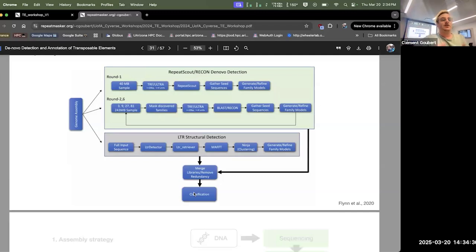So in this software, the classification is based on a high-quality database of protein and nucleotide sequences. It's going to help you identify known families, or at least look-alike families. But of course, if you have something completely different that has never been found, it will simply be labeled as unknown. But you have the ability to go further and do this manual refinement later.